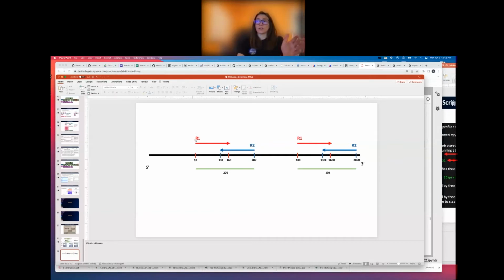So it'll look at the start of this one, and then it'll go to find its mate pair, the closest one that maps to it, right? So this forward read is going to be closer to this reverse read mapping location than this one. So it'll look for the first one of its mate pairs, again, that has the same address of where it aligns to next. So that's why this one will go with this R2 mapping to the same transcript, one location.